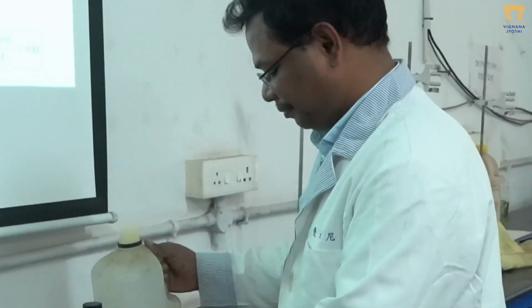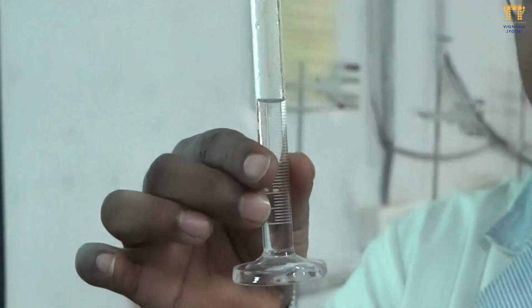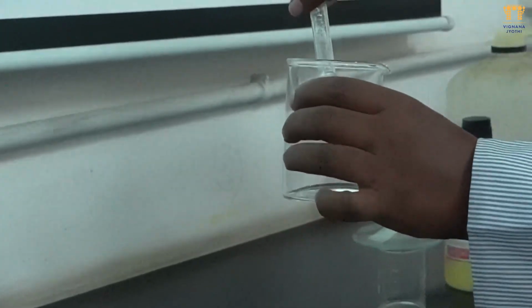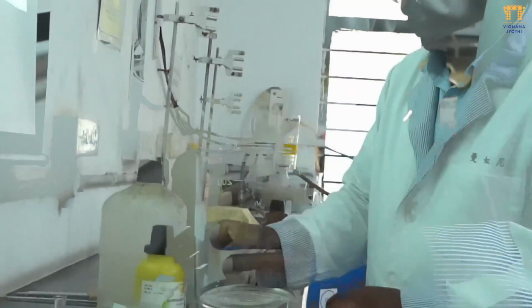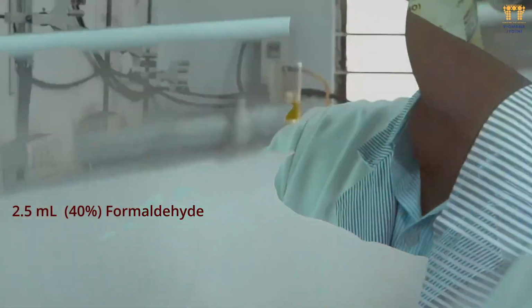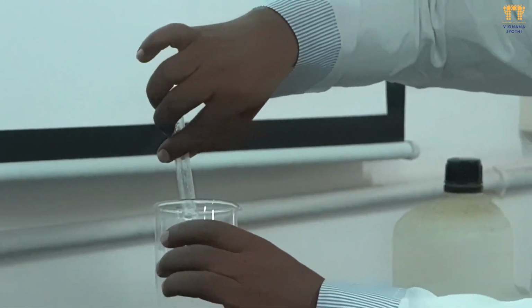Take a 250 ml beaker, then take 5 ml glacial acetic acid into the 5 ml measuring jar. Exactly, we can take 5 ml glacial acetic acid into the beaker. Then you can take 40% aqueous formaldehyde solution, 2.5 ml, into the beaker. It's 2.5 ml formaldehyde solution.